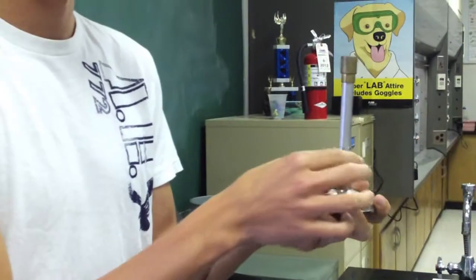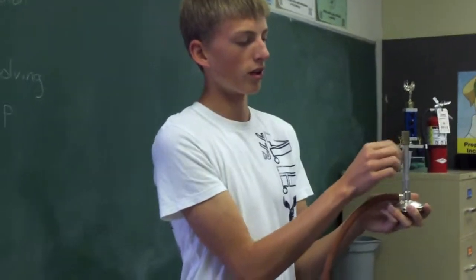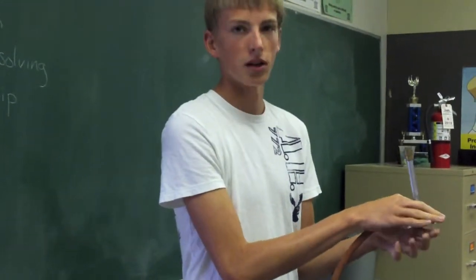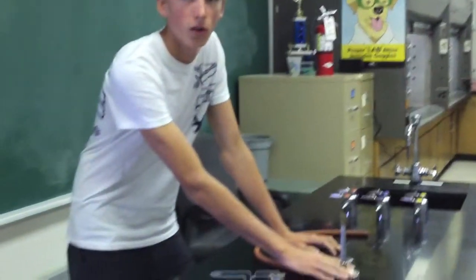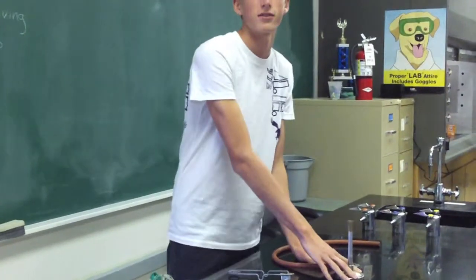When you're starting, when you're igniting a Bunsen burner, you want the valves to be closed. You can hold the barrel of the valve right here. This shouldn't get too hot. And whenever you're using a Bunsen burner, make sure that your hand is always on the Bunsen burner holding it down. You always want to have your attention focused on the ignited fire.